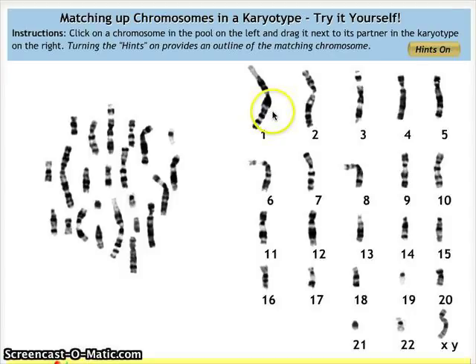Starting with the first one is usually the easiest — we look for the homologous pair that is the longest. There appear to be two candidates. Placing them next to each other, we can see it's slightly off. Near the centromere, one has a dark area while the other has a light portion near the centromere. Here the centromere is in the center of the chromosome — that's a metacentric location — while on the other it's slightly above center, which is a submetacentric location.